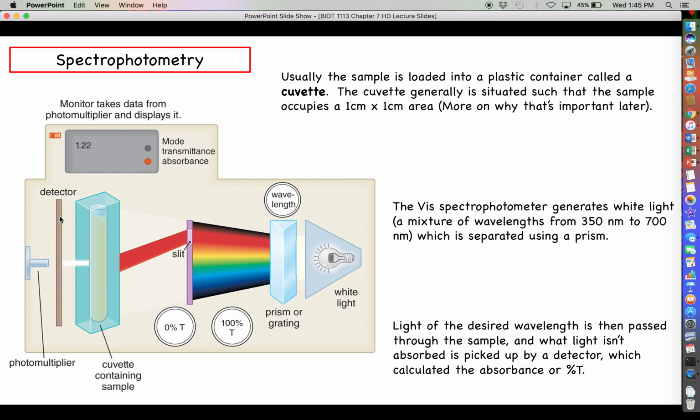But if you've got a mixture of a bunch of different proteins, not every protein is exactly the same. And we'll have more to say about that a little bit later on. But basically, there are limitations for using the Beer-Lambert law to directly measure concentration. So it's going to be a case of kind of knowing when you can and cannot do it.